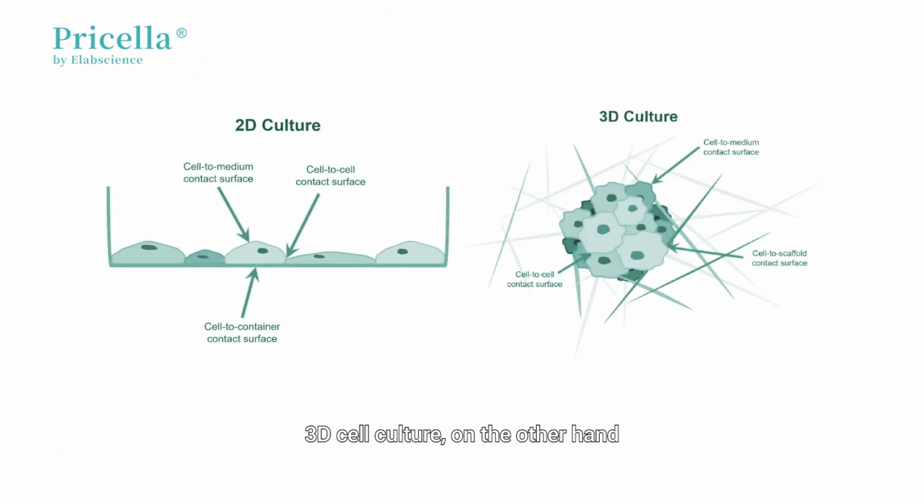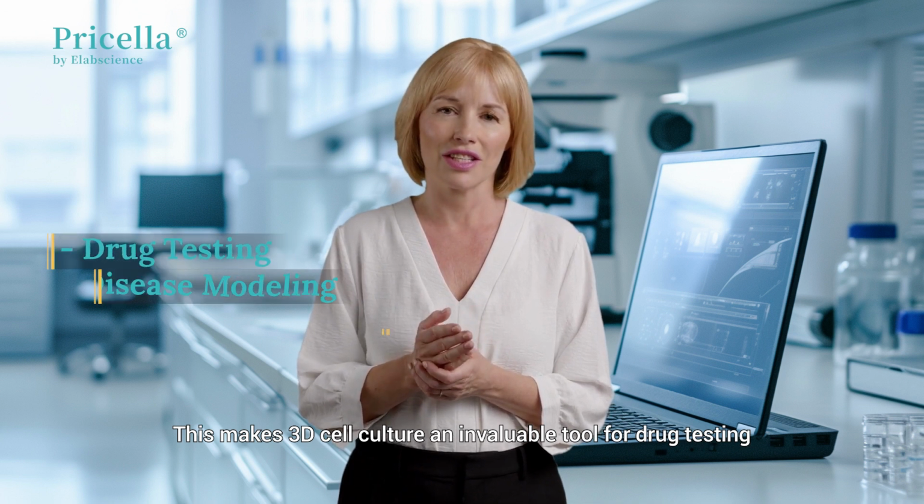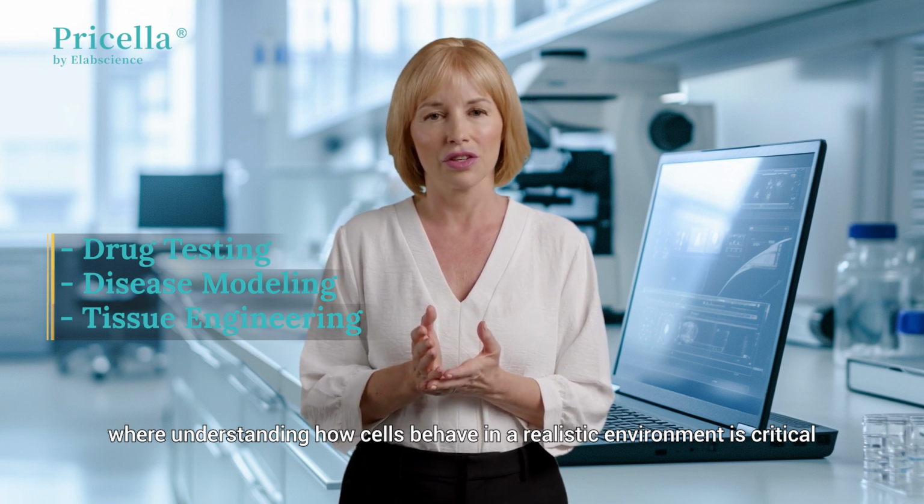3D cell culture, on the other hand, mimics the natural in vivo environment much more accurately. Cells can interact with each other and their surroundings in a way that closely resembles what happens in tissues and organs. This makes 3D cell culture an invaluable tool for drug testing, disease modeling, and tissue engineering, where understanding how cells behave in a realistic environment is critical.